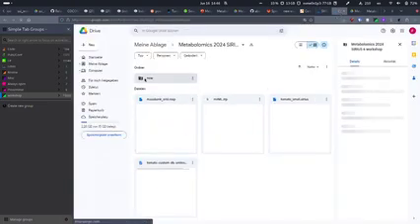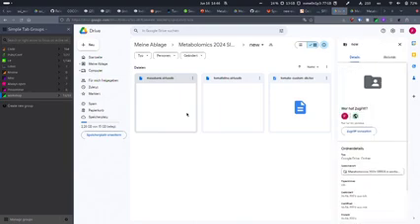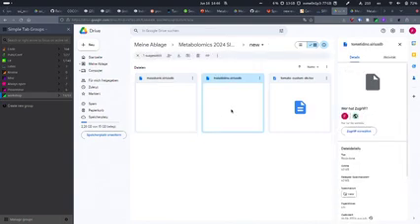And there's now a folder called new, which has 2 new files. It's not important if you haven't downloaded it. Oh, it has 3 files, but the important one is pretty much the Tomatidine SiriusDB. It's not important if you haven't downloaded it, but maybe if you can do it now, you can then follow along in one example I will show soon.